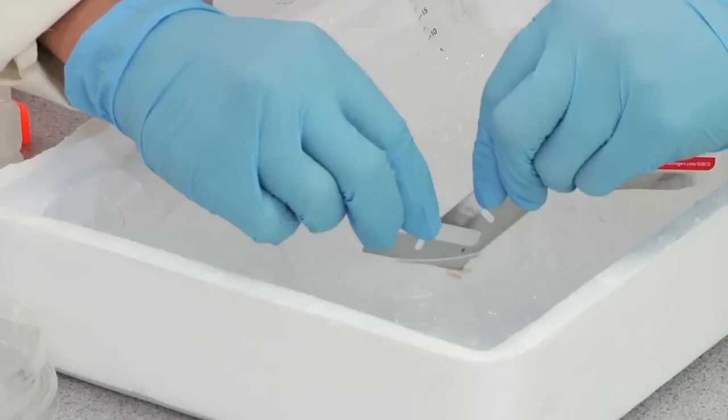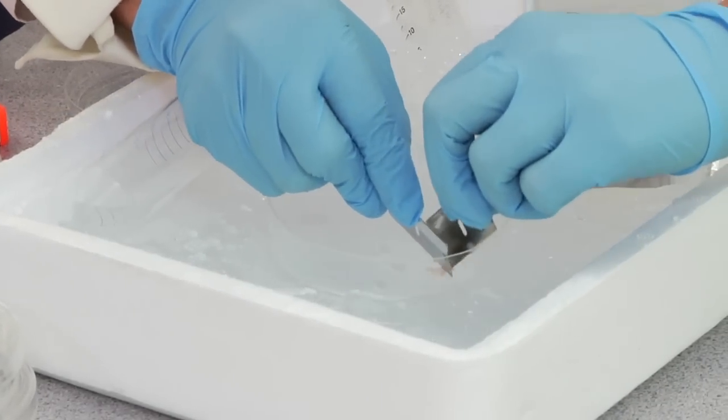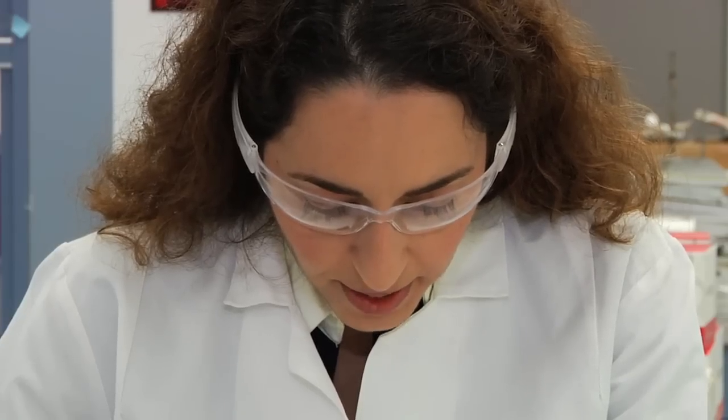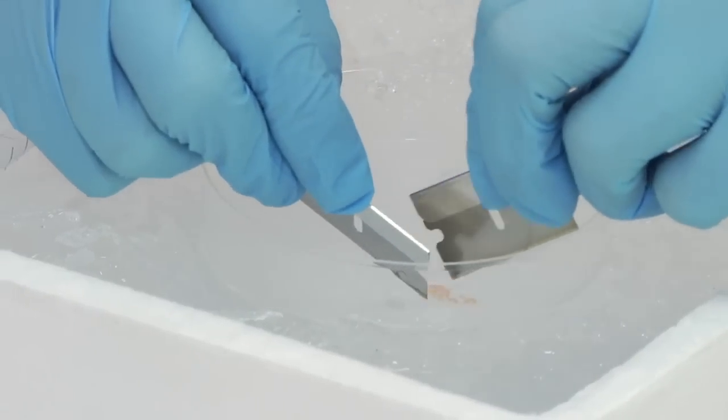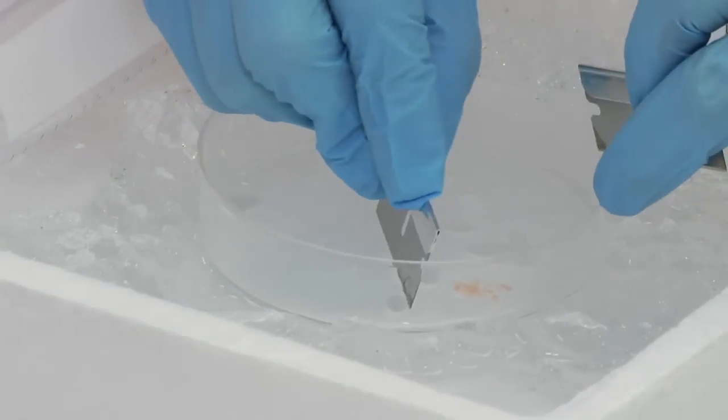Make sure you finely dice the tissue because the next steps will be using syringes. We added 250 microliters of ice cold PBS, but for more tissue than that, add 250 microliters of ice cold PBS per 50 milligrams of tissue, up to a maximum of 2 mLs.